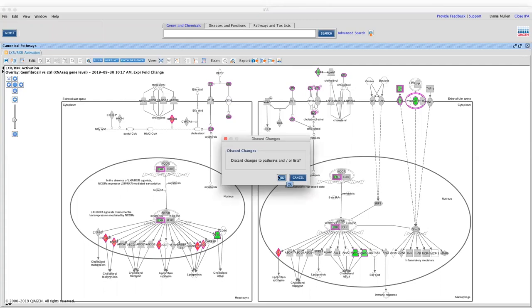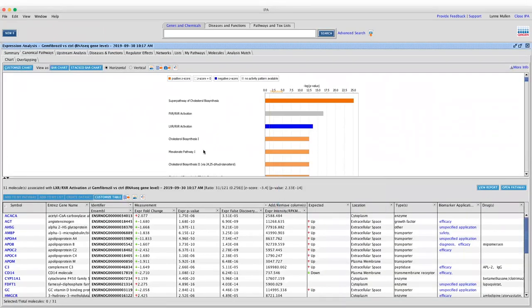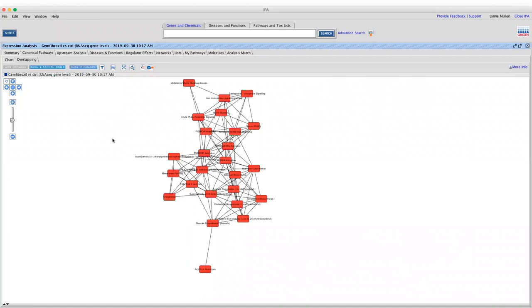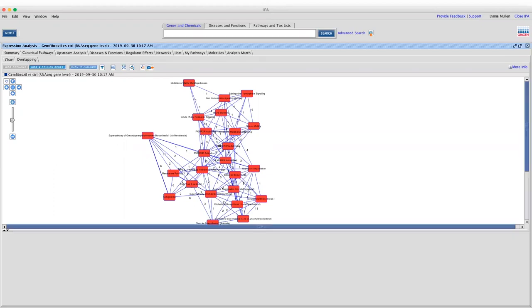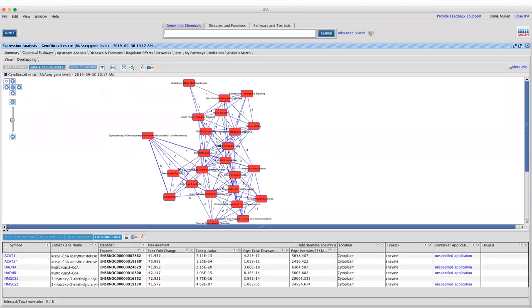If you're interested in seeing which pathways share genes, go to the Overlapping Canonical Pathways tab. Each canonical pathway has a red rectangular box, and a connecting line means one or more genes are in common. You can show the number of common genes, and clicking on a line brings up a table identifying those molecules. You can also show p-values and further manipulate the image.